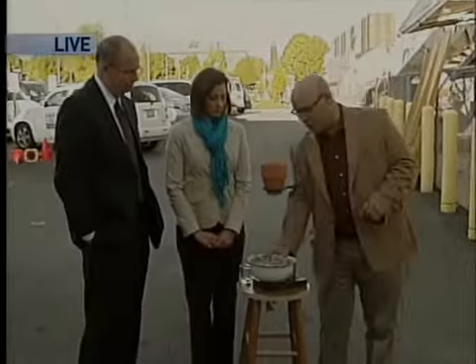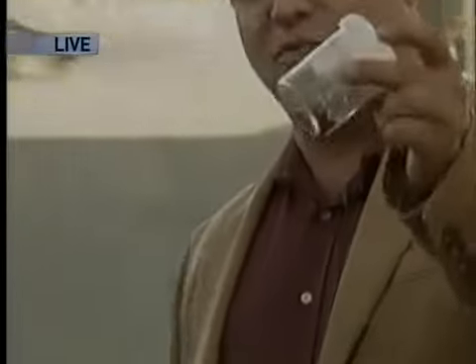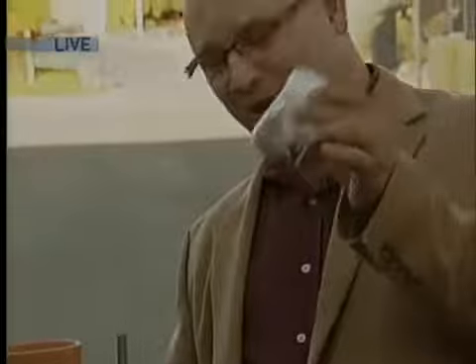Now we're going to do another oxidation reduction reaction. This one does involve oxygen, but it's fixed in rust. This is iron oxide, like we all get on our cars eventually here in Illinois. I scraped this off of Robert's car a little bit earlier this morning.